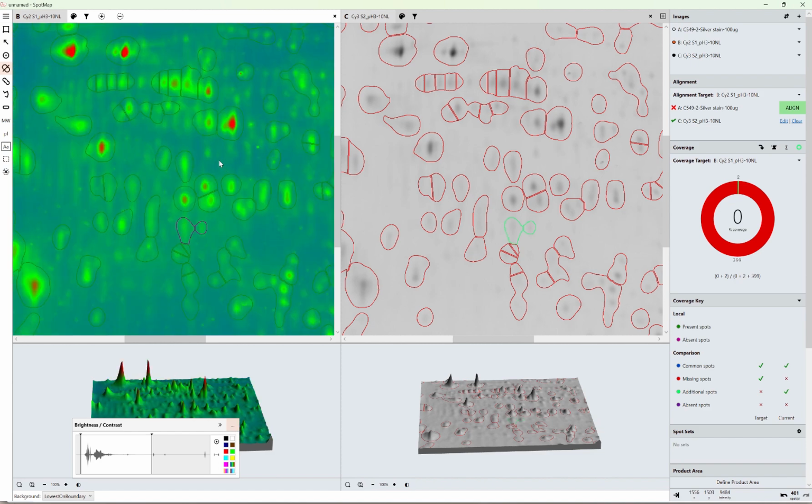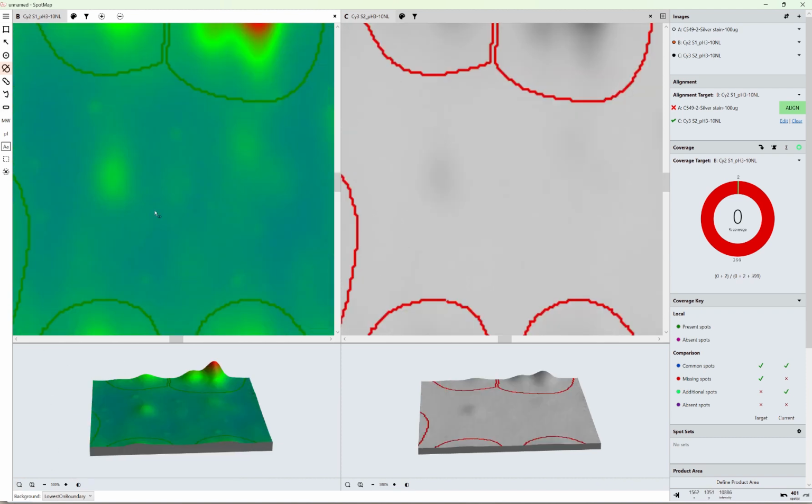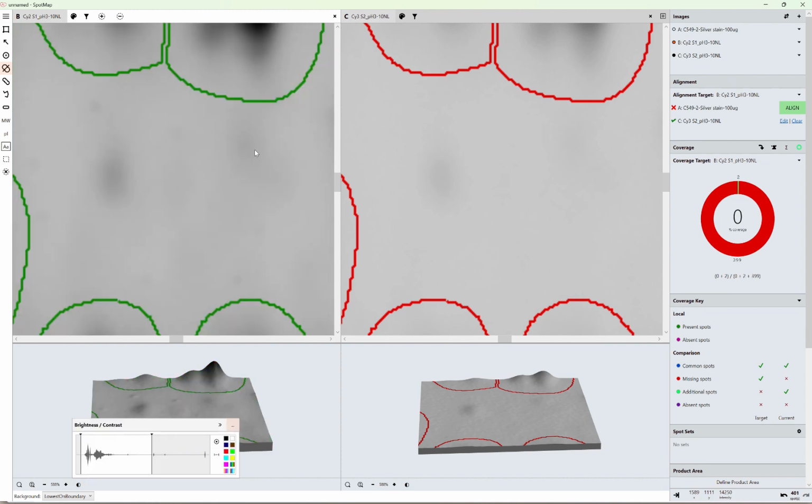So these are completely false color overlays, but they allow you to really see very subtle changes in signal versus background. That's what they're designed for. They basically enhance the contrast of the edges extremely. So if I come back to, now I'm using this green overlay I've got here. If I turn this back to black and white now, you can see these spots.